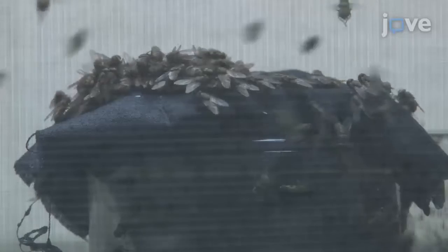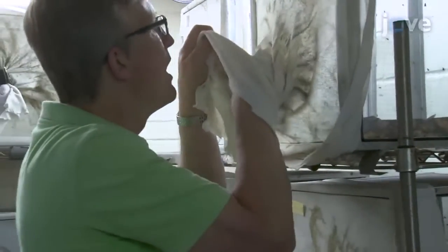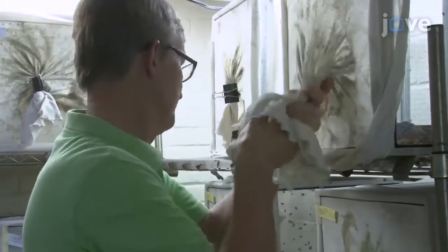After 2 hours, the gravid females will oviposit enough eggs for the next generation. Typically, 2,500 flies will produce 8 to 40,000 eggs in 2 hours.